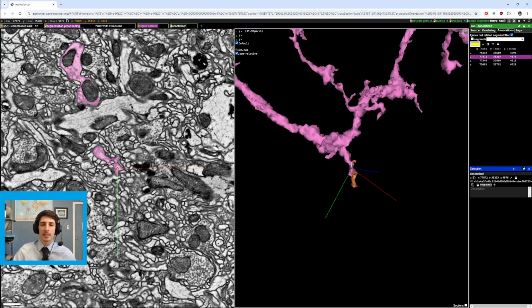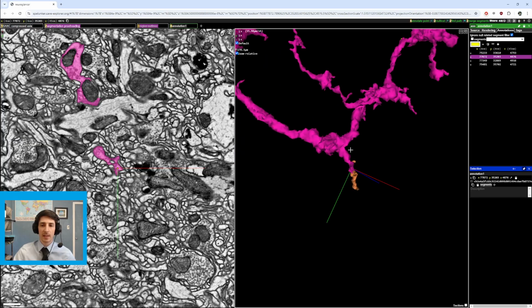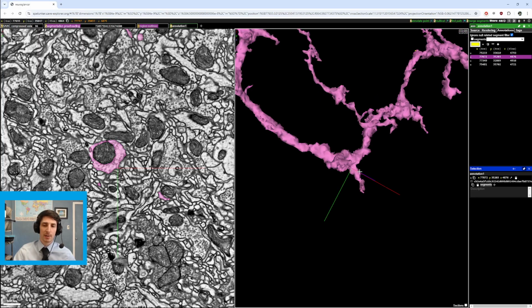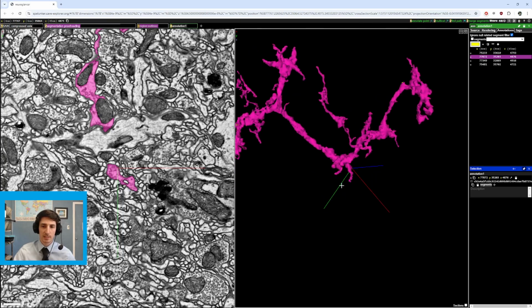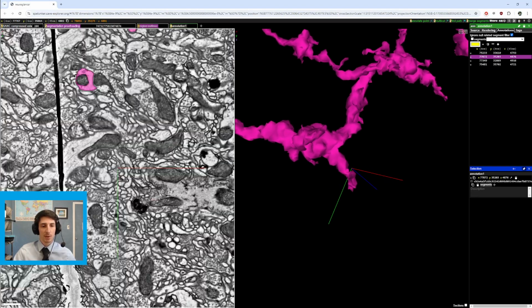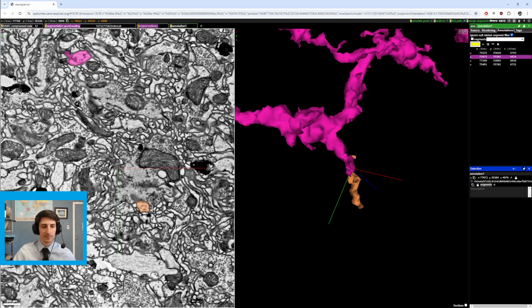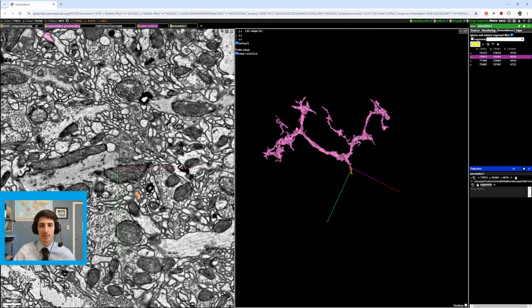So this was the first one I looked at because it is a thick branch coming to an angle, and when things do that, usually there's something coming off them. If we get rid of this, as you can see, something was going in that direction. So I investigated that, but it looks like a lot of these are shorter branches, even though their thickness is more than normal. As you can see, there's a little bit of a jump. It goes through a swirl of the membranes, and then it kind of dissipates.